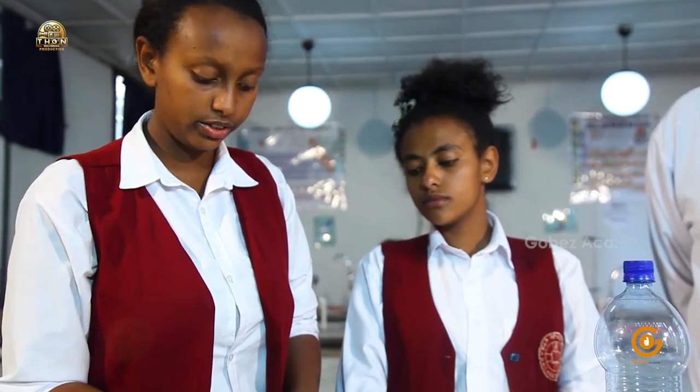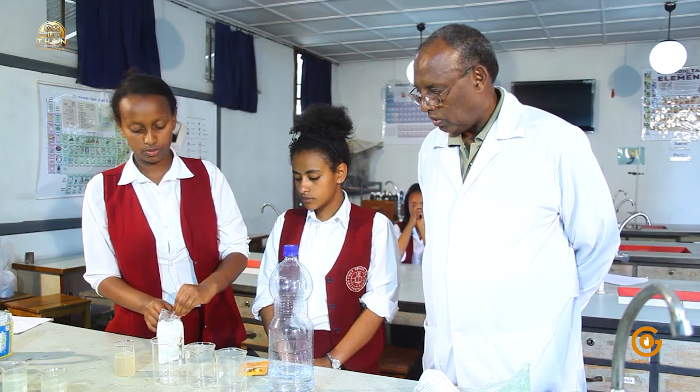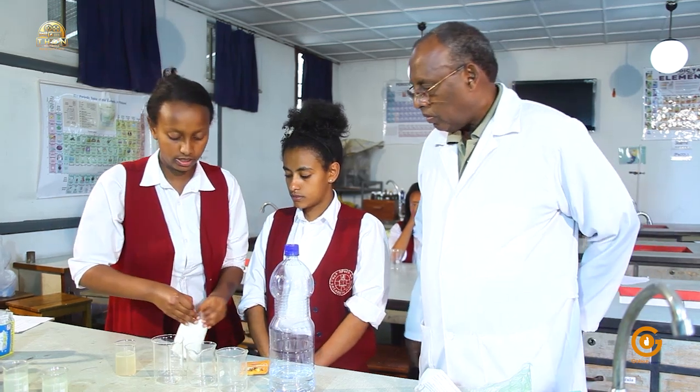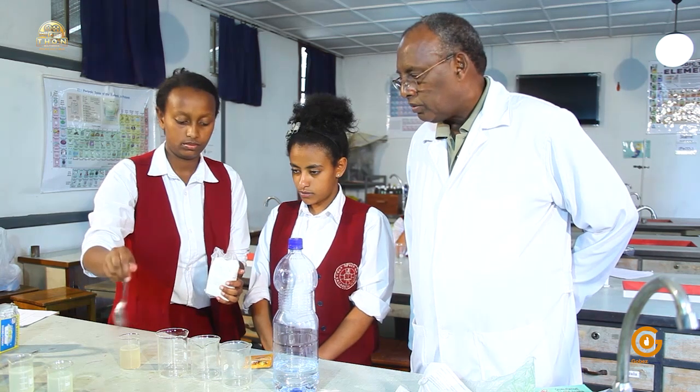Okay, so add table salt. This is going to be the solute for this experiment. To have a standardized amount, I will take 2 tablespoons.